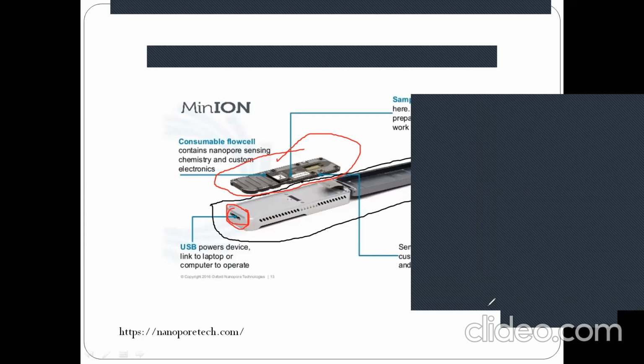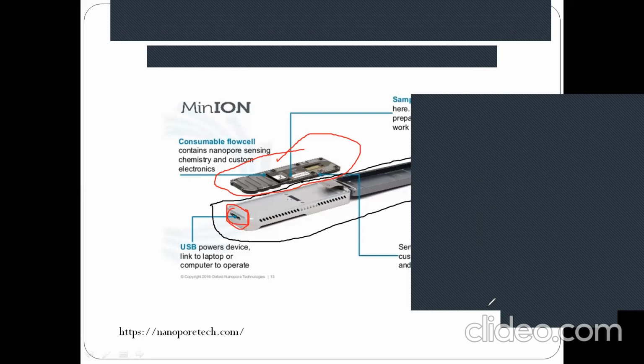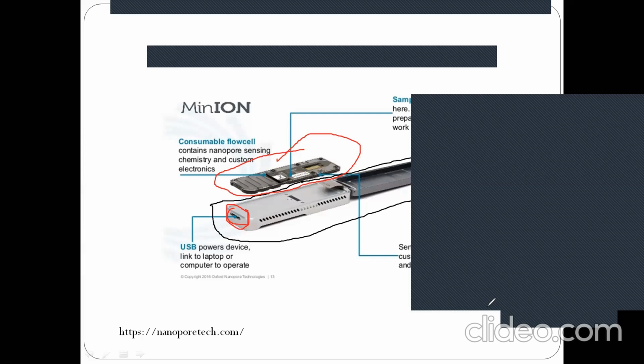So the answer to the first question is that it is not always good for up to 50 runs, because this is a very new technique, introduced only in 2012. It is a constantly evolving system. The basic system introduced in 2012 was substantially improved in 2019, I guess. It is constantly improving from the manufacturer.